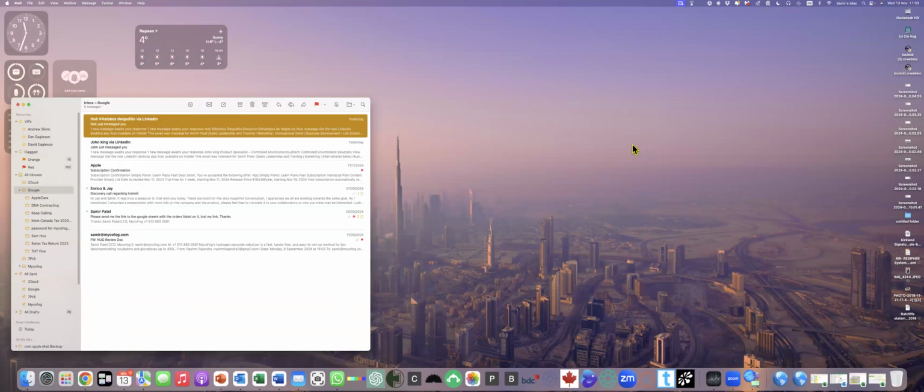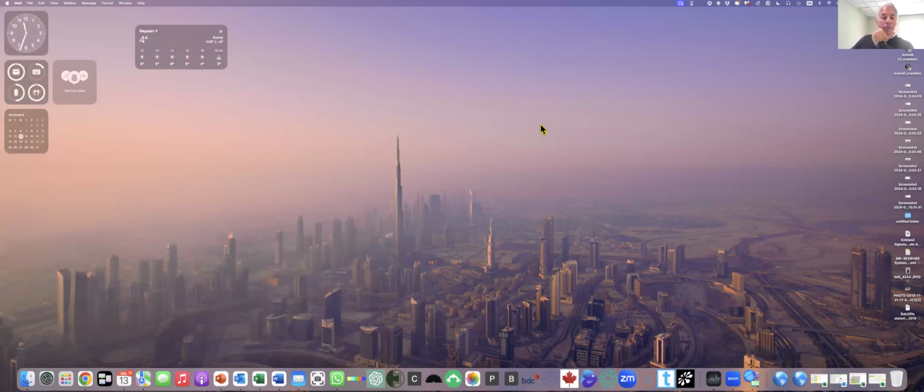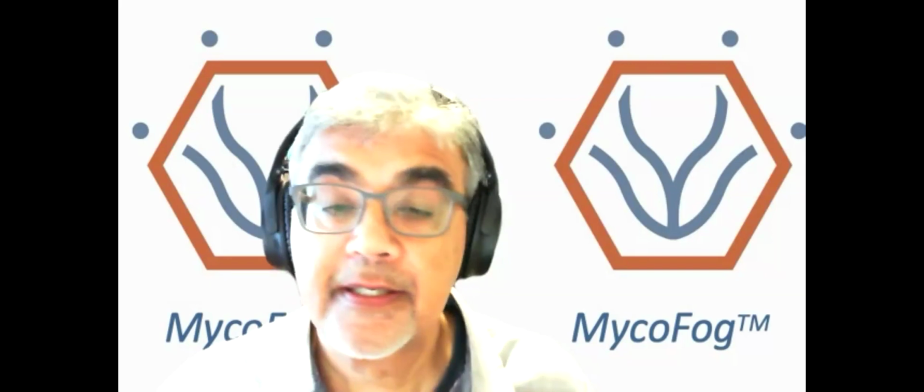Okay, perfect. Samir, just before I continue, can I have you maybe either stop sharing your screen or feel free to share the presentation again? Yes, I can. Yeah, no worries. And then the next question is, how often should one decontaminate an incubator? What is your recommendation?